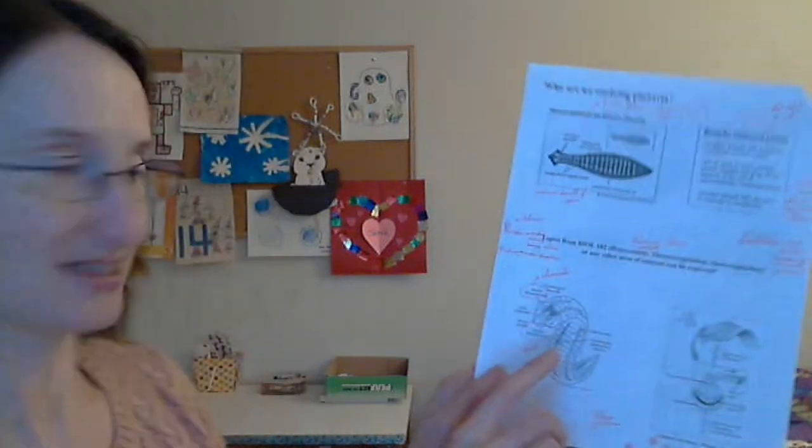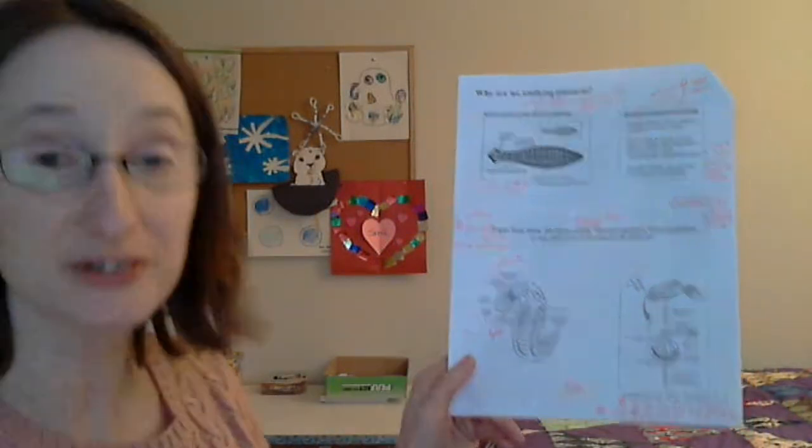Okay, so you could do an experiment with chemicals. You could test different concentrations, different types of chemicals, again, whatever. You'll see in this picture of the planaria, there's also an area where they have photoreceptors. So you might design an experiment looking at light. How do they respond to light?